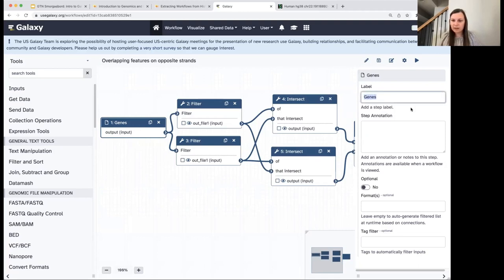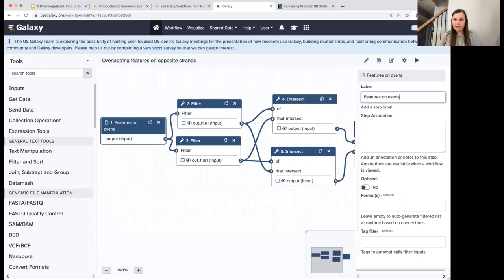I'll click on the first step with the genes and rename it to 'features on overlapping strands' — so the input can be genes, exons, introns, or whatever genomic feature we're interested in.